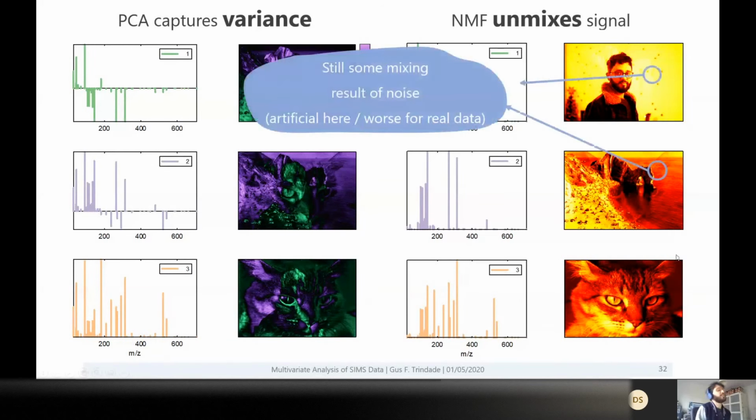And it's worth pointing out that I added some noise, and as a consequence, the final results will still show some mixing. You see here that you can see the ear of the cat in the dodo door. I don't know if you can see here the dodo door in my living room, which is not true. So yes, it's due to noise.